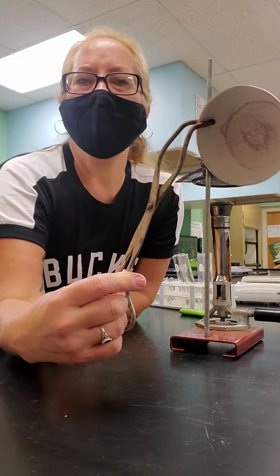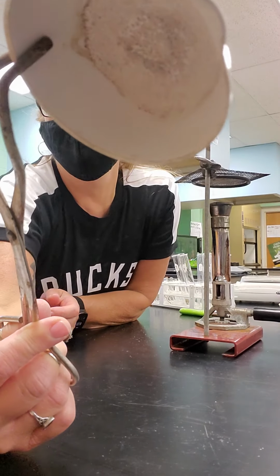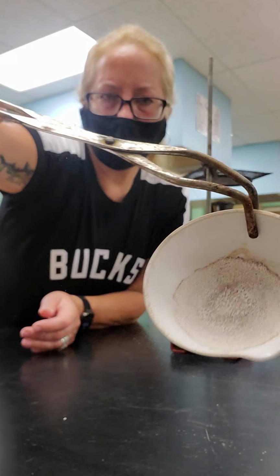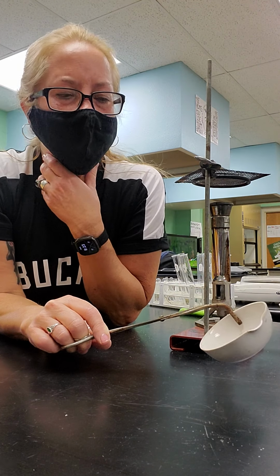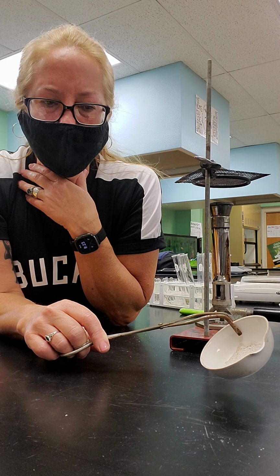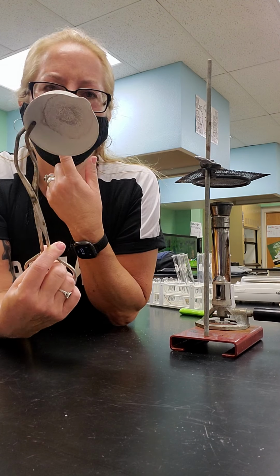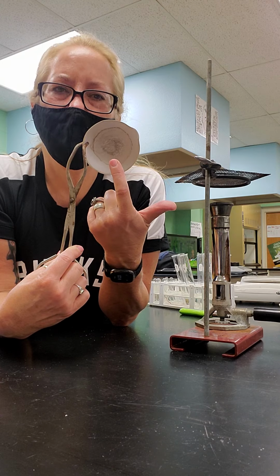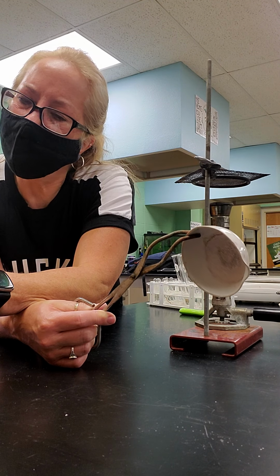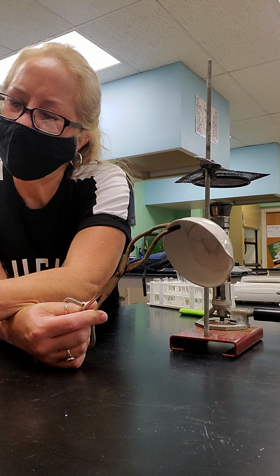So right now we have the sodium chloride back from the solution. We had sodium chloride and water that we filtered out of the sand, and now we evaporated the water, so the sodium chloride is left. So that's a physical change. So filtered and evaporated.